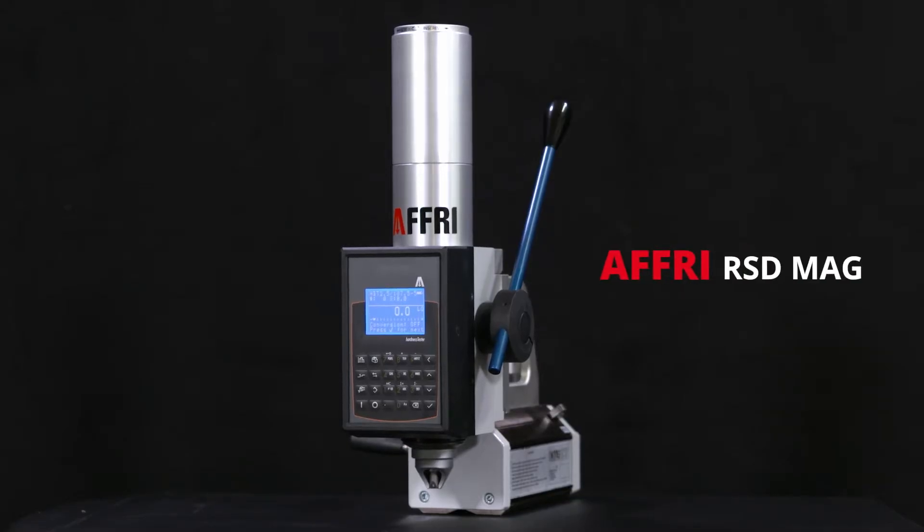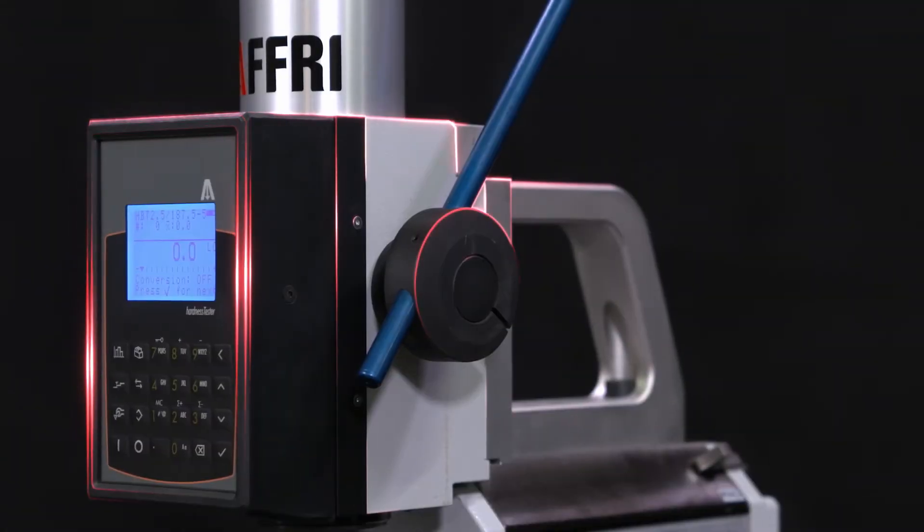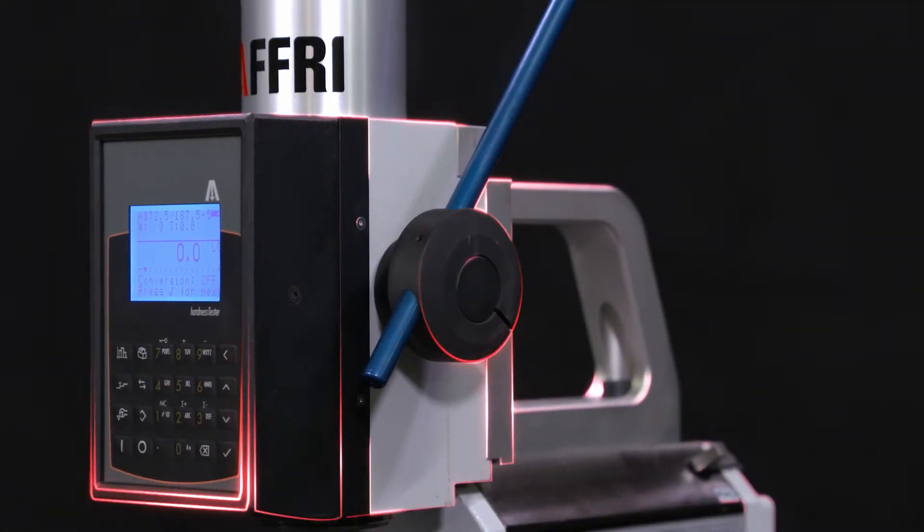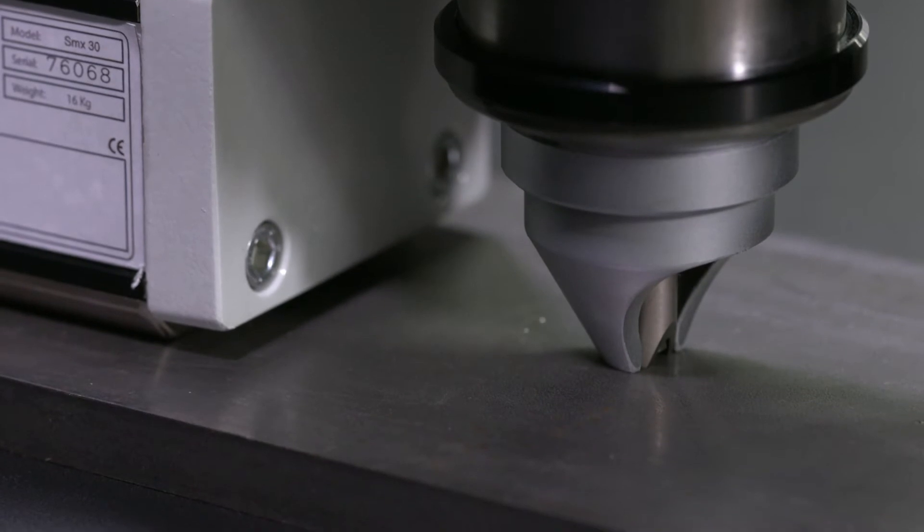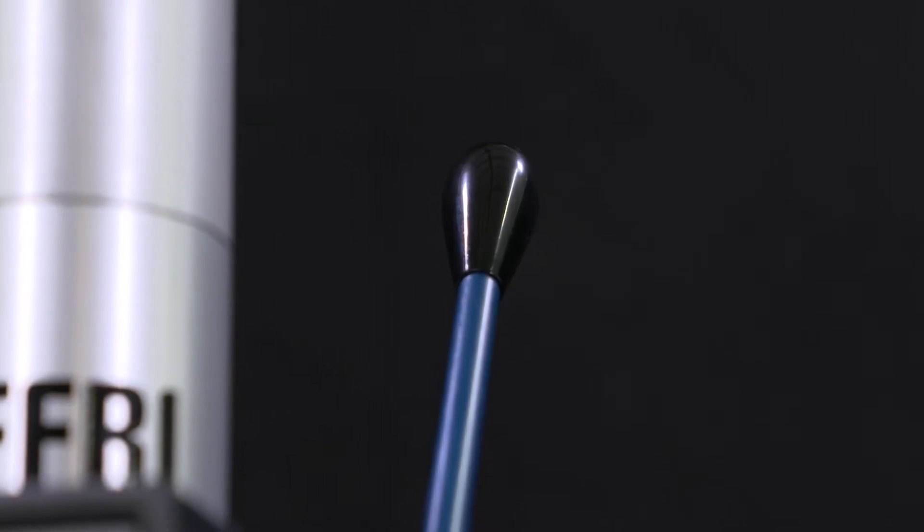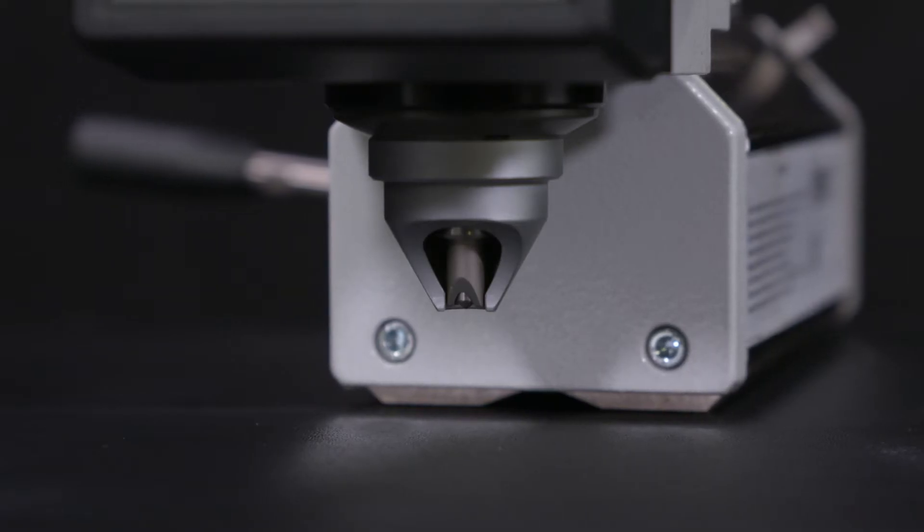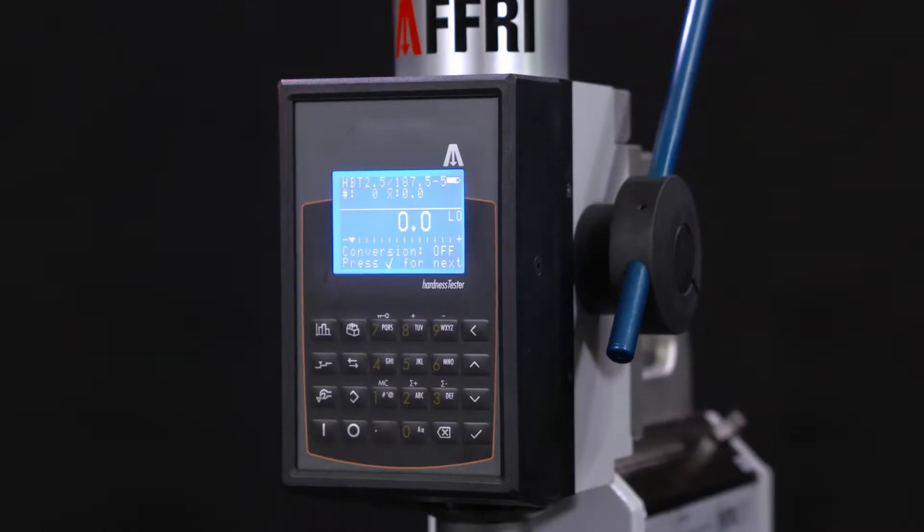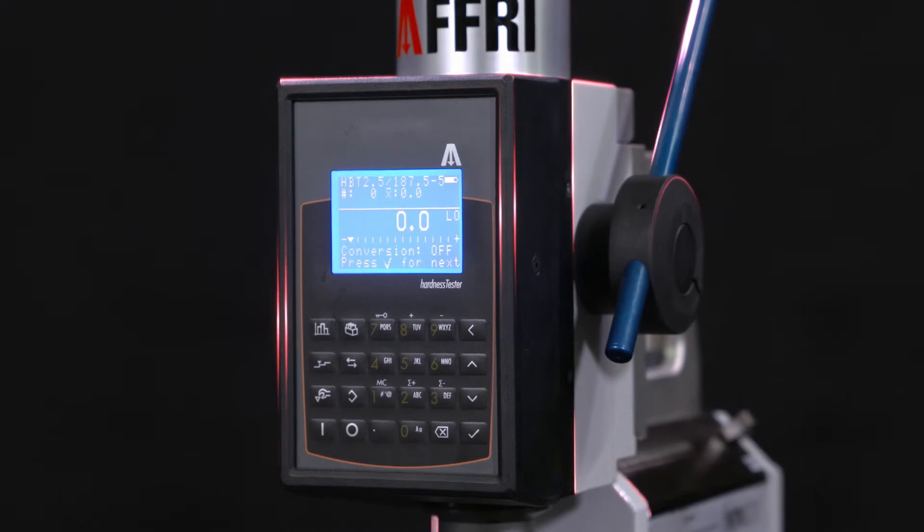The RSD-MAG is the first automatic portable hardness tester for Rockwell and Brinell testing, in compliance with ISO 6508 ASTM E18 and ISO 6506 ASTM E10 standards.